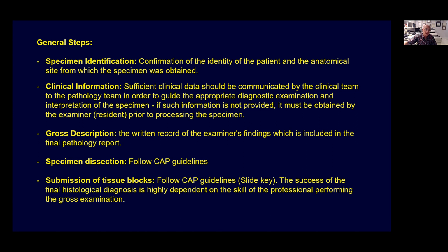And in my practice, I really consider that it's not appropriate to sign out a pathology report that says in the clinical history unknown or not provided. If it's not provided, we have the obligation to look into EPIC or any other source for what is the reason for the specimen that you're going to examine. And so just remember, I know that many colleagues sign out cases with no clinical history, and I respect that. But my personal recommendation is that you never, never, never sign out a case without clinical history.